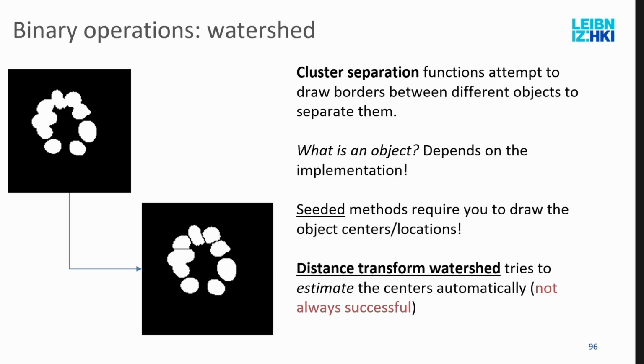is called a distance transform watershed. What it does is basically a watershed transformation. Good that I never explained what the watershed is. It basically starts at key points, and then they start flood filling from these points until they hit another area. But you can try it out in general. Here it almost works, so it splits off some cells as I wanted, but these ones here are left alone. It's not perfect, but it's one good estimate for the start.